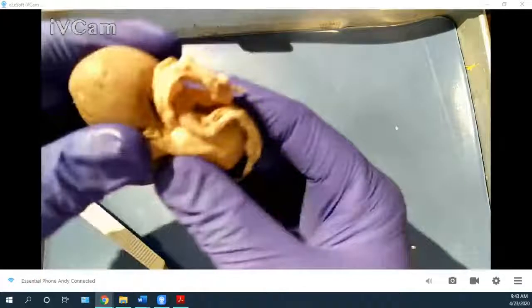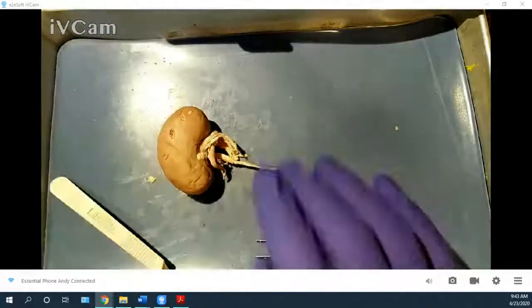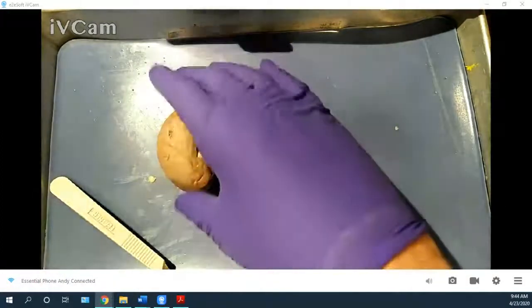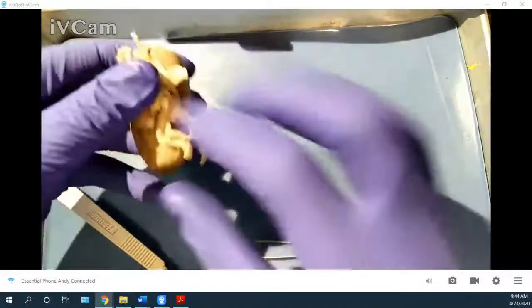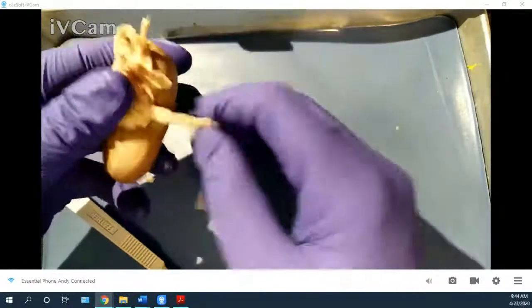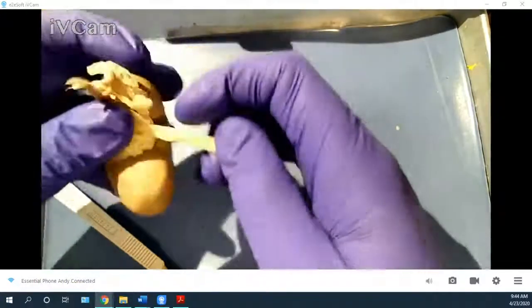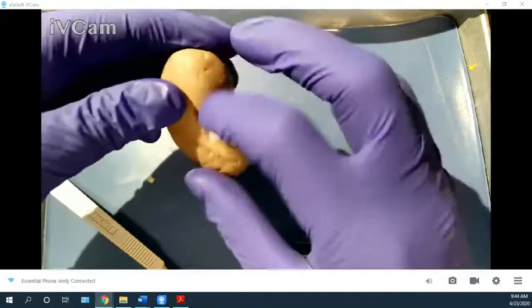And then we can figure out a little there, because the ureter points down. We are looking at a right kidney. So this is a right kidney at this point. So the entrance of the renal vein, the renal artery, and the renal pelvis, or the ureter right here, is entering in through this hole right here called the hilum, right in here.